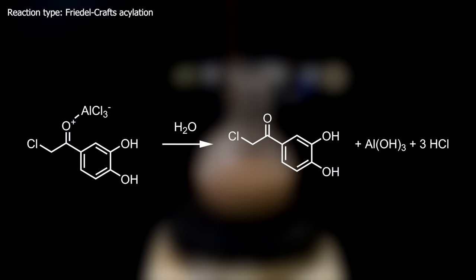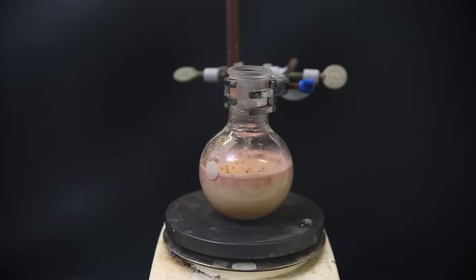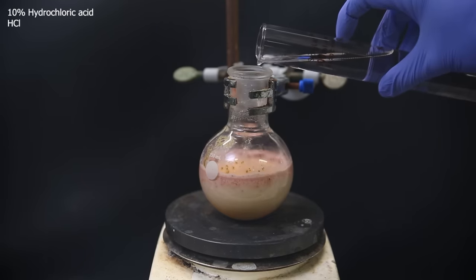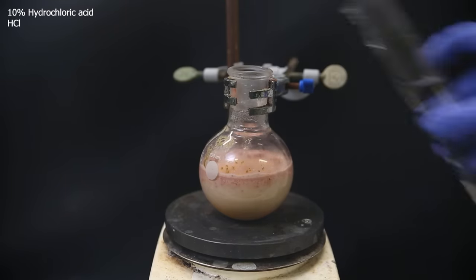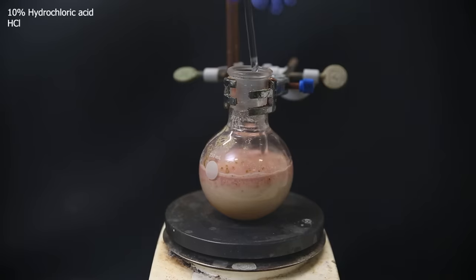When I came back, it had stopped stirring and it became mushy, so I hope the reaction has at least gone to completion. Now to destroy all of the aluminum chloride and any complexes, I gradually add an excess of 10% hydrochloric acid. At first it just sits on top so I have to mix it in.